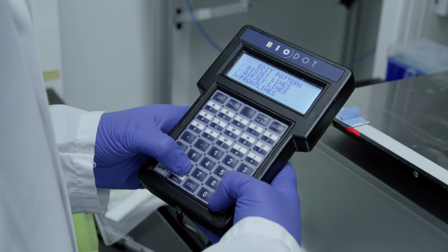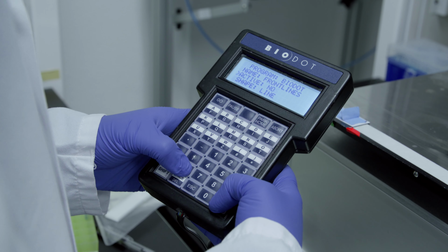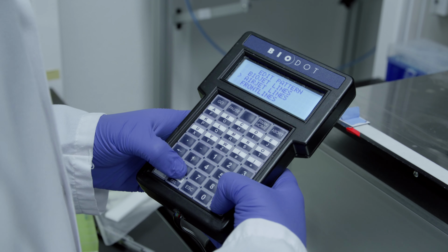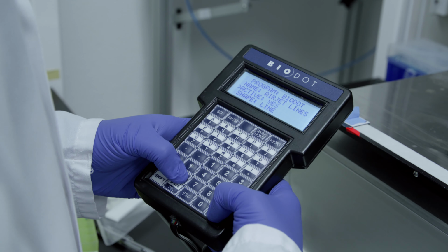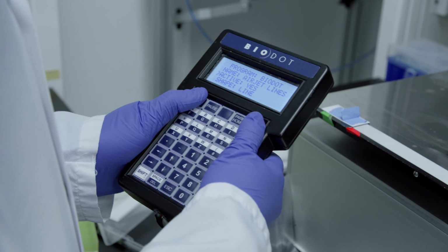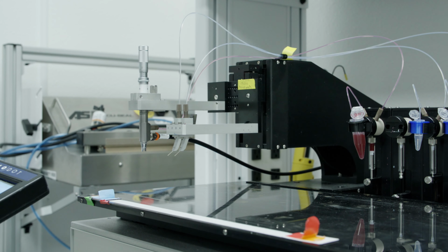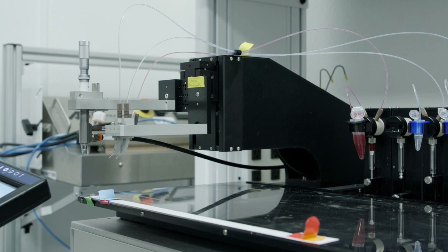So I'm going to disable our front line since we're no longer dispensing antibody onto a membrane, and I will enable the air jet. And now we are good to go. When we stripe, we're immobilizing it, but here we're only kind of temporarily storing it.